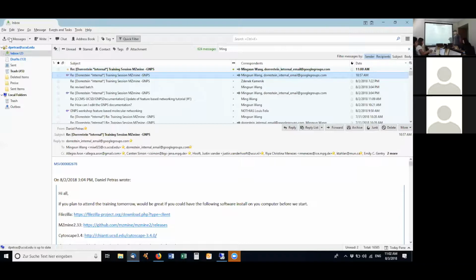As you're probably aware, Ming created a new documentation for GNPS, and the idea is to couple the training with the documentation. That's why I just emailed you a link for the new GNPS documentation, where in theory you should find all the information we talk about today.